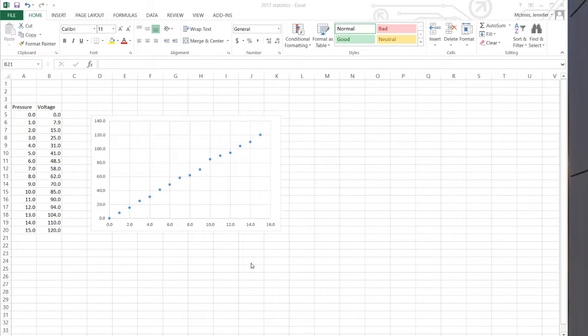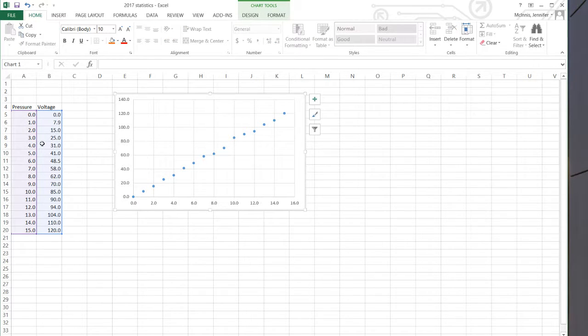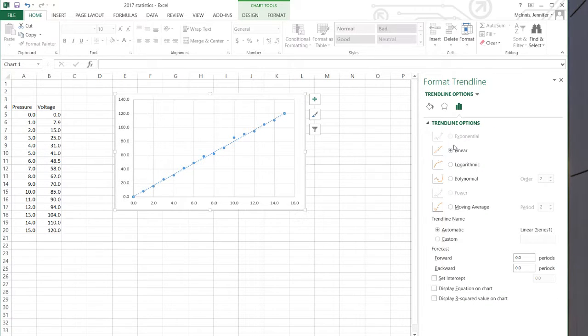In this video, we'll take a look at some of the related calibration information in Excel. So I have a calibration set of data here. I've plotted it on a graph, and probably you already know that you can add trend lines in Excel. So I'm going to go ahead and click on the plus sign next to my chart, go to trend line, but choose more options. This will allow me to set up all of the details.